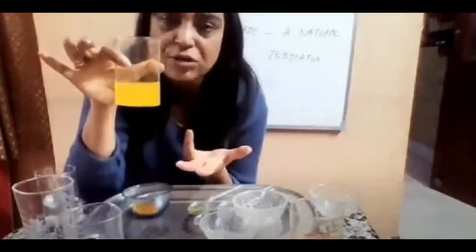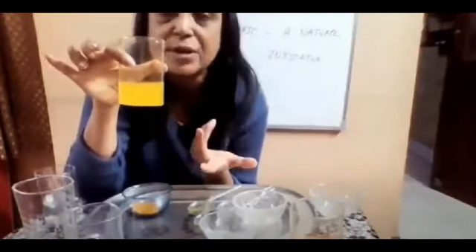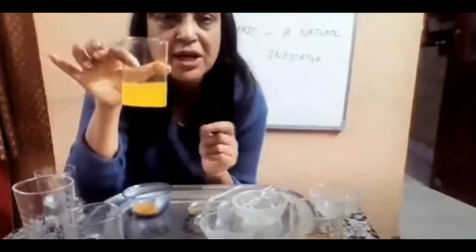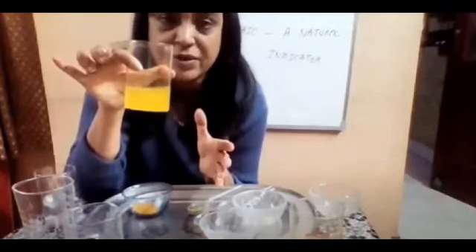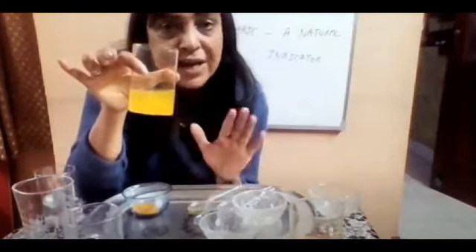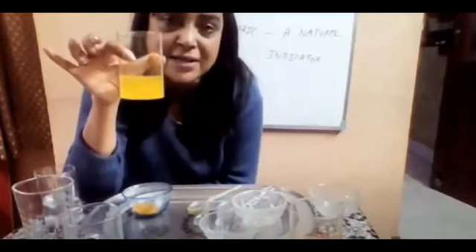This is no change. So somebody says when there is no change, you can consider that substance to be acidic. But remember 10th class, no change is never considered to be a test in chemistry. So if I want to test anything as an acid with turmeric, I fail to do that, because acids won't give any color change with turmeric. It remains as it is.